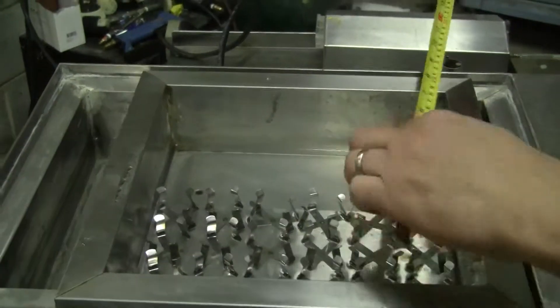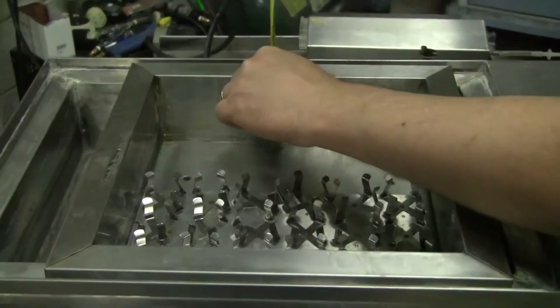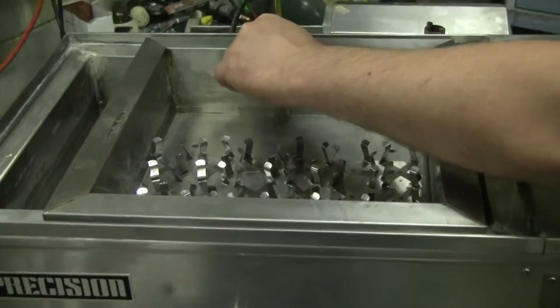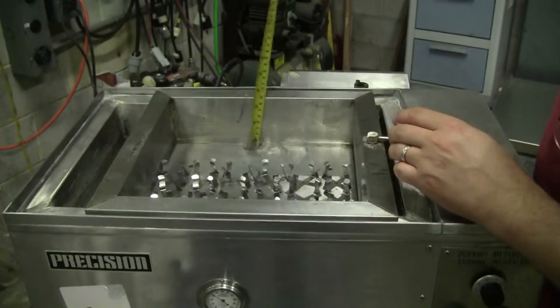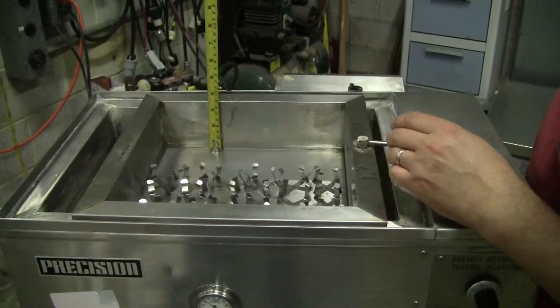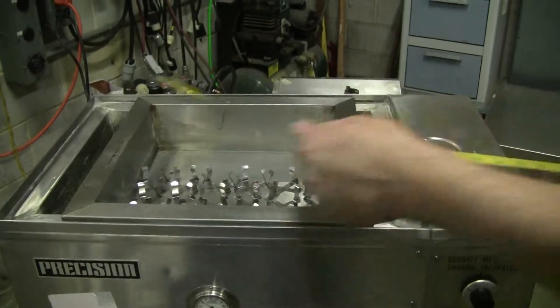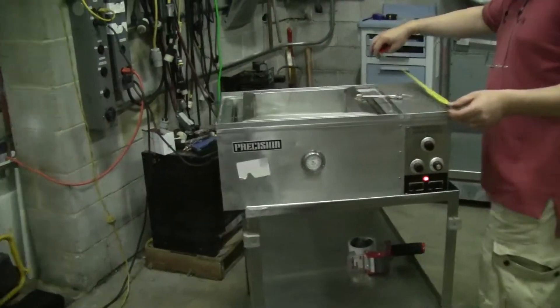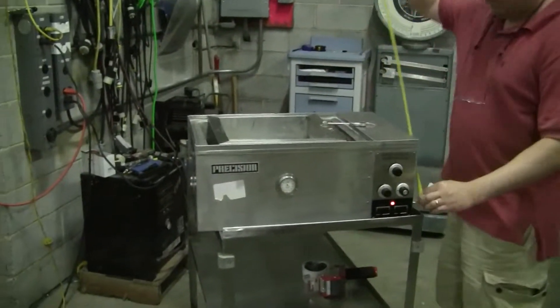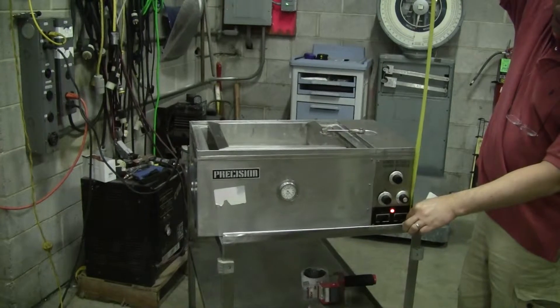It's about 10 by 10 and that is only about three and a half inches deep. I'd say you get the water level — from historic use it looks like they had it at about a two inch level. Overall dimensions of the unit: 23 inches by 17 by just about 11 inches.